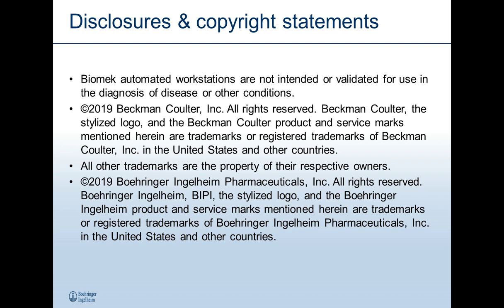Making a method overly complex is not going to benefit you in the long run. That obviously changes once you get into scheduled environments. The level of complexity increases when you're talking about integrated devices in a scheduled environment.